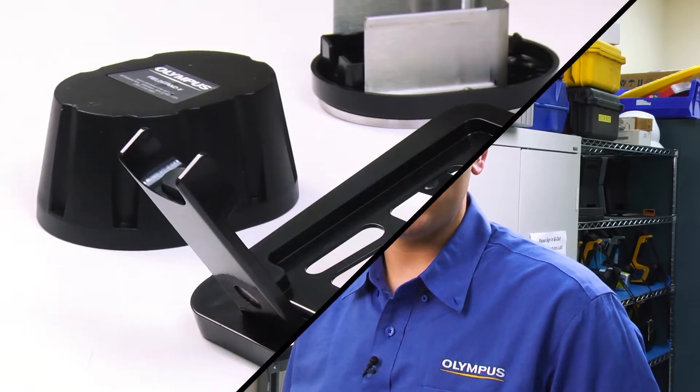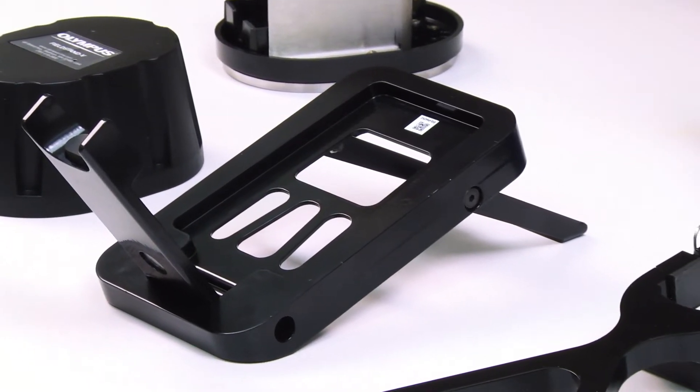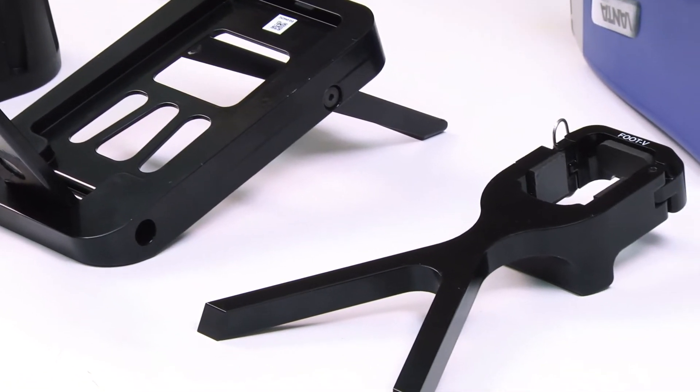Hi, my name is Andrew Cardamone, and today I'm going to show you how to use the probe shield, the field stand, and the soil foot accessories that are available with the Vanta. Each of these accessories are an easy-to-use, cost-effective way to assist you with data collection.